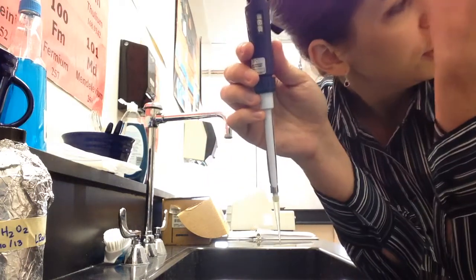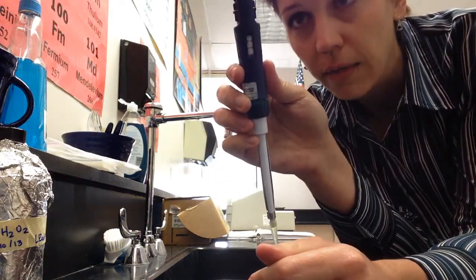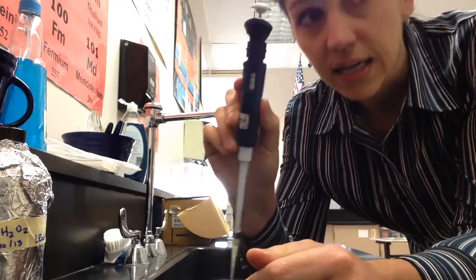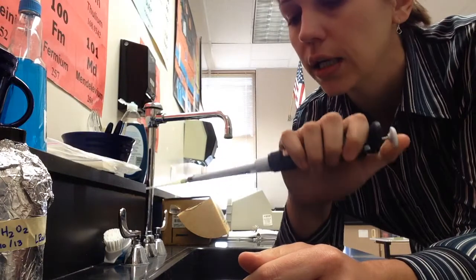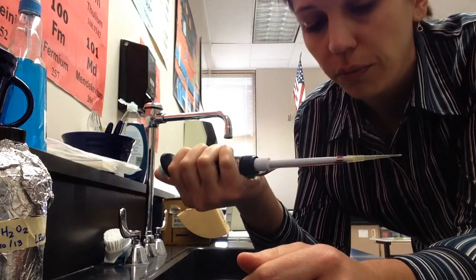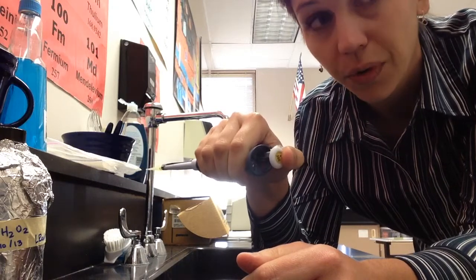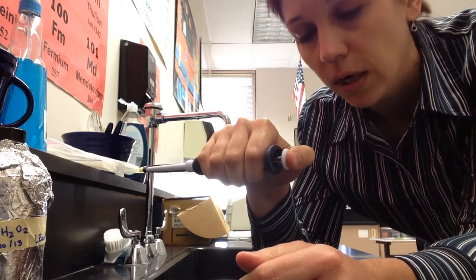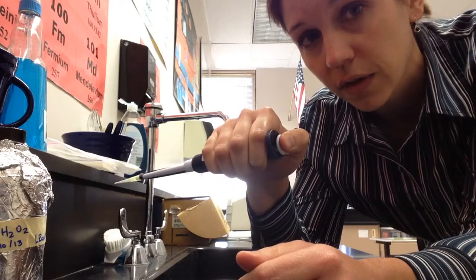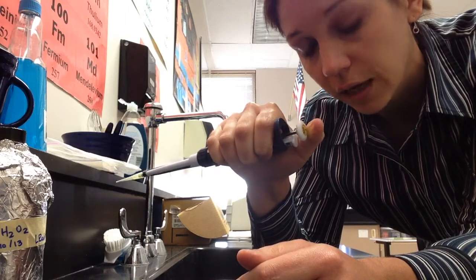So what you're going to do is grab your micropipettor, and you're going to verify that it says 100. Before you immerse it in a liquid, you're going to make sure you know how it works. You put your thumb on the white depressor up at the top, and when you push in, you'll feel it stop once, and when you push in the second time, you'll feel it stop the second time. You want to get used to what that feels like.